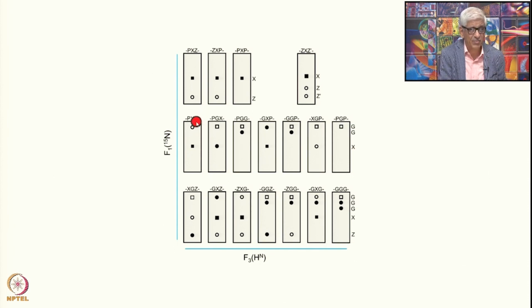Now similarly, if I have a proline with a glycine there. The glycine has a very distinct chemical shift with regard to the N15, and those peaks will appear at the top in the N15 chemical shift. Okay. Therefore this will produce a distinct pattern. You can immediately identify that this is the glycine here. Now if the glycine is here at the end, then of course the X residue will show a peak here and the glycine sequential peak will appear here.